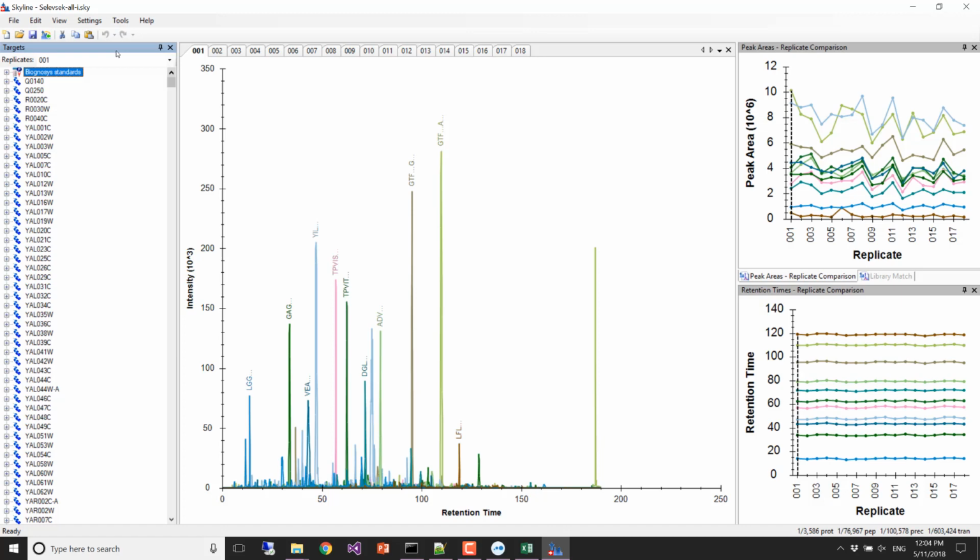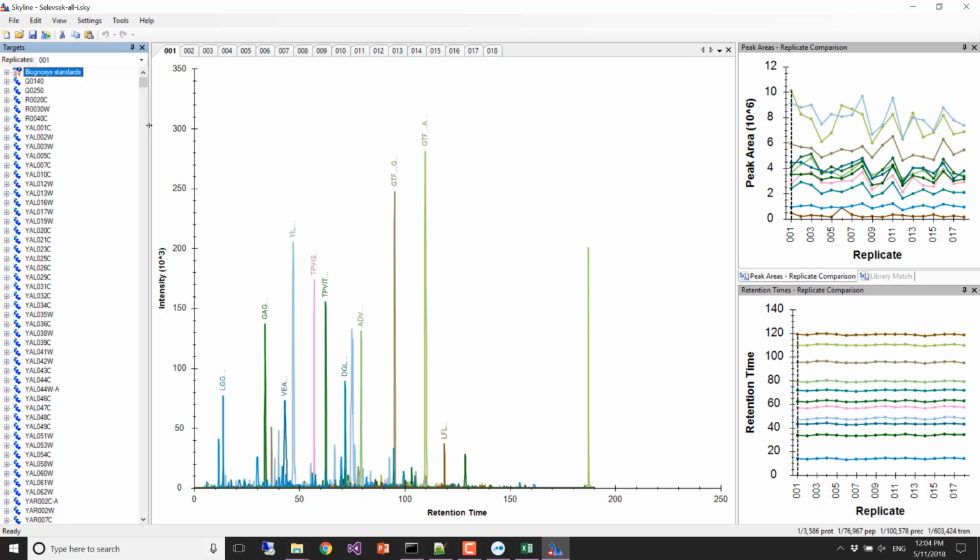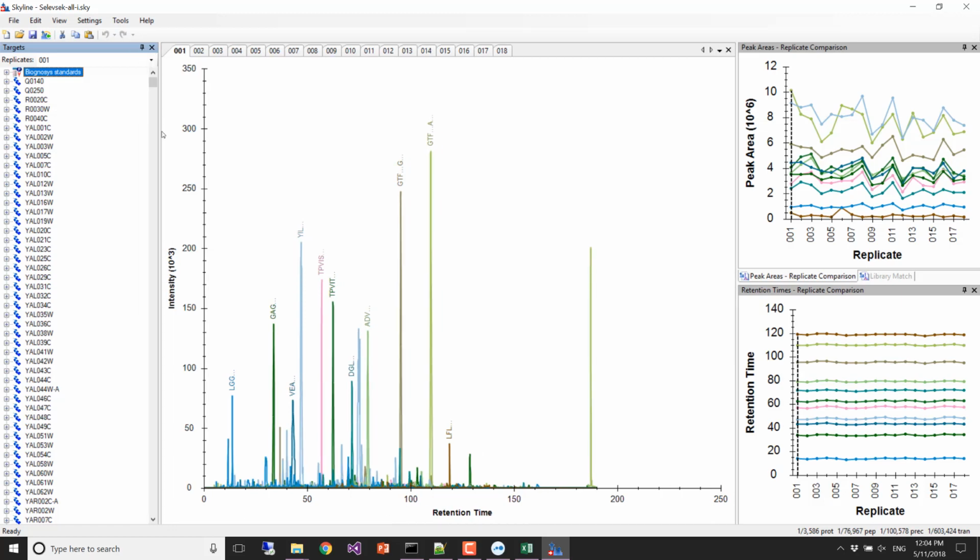We know that we didn't kick out anything that we're interested in. Yeah, absolutely. I'm pretty sure that on average you're going to do yourself more harm by having a lot of noise than by having fewer things. But that's my bias.